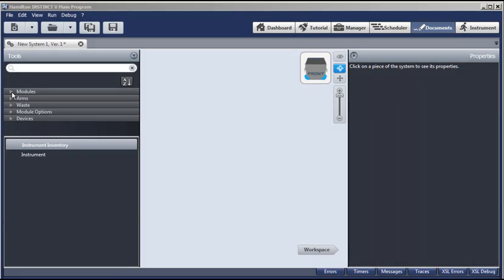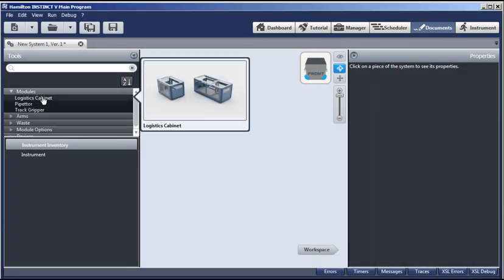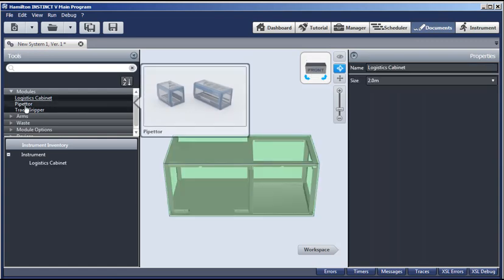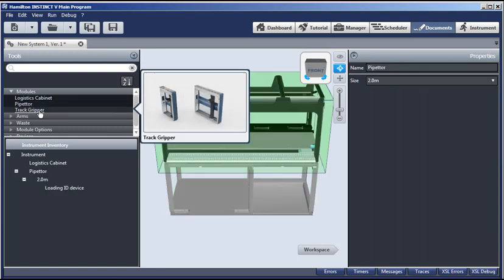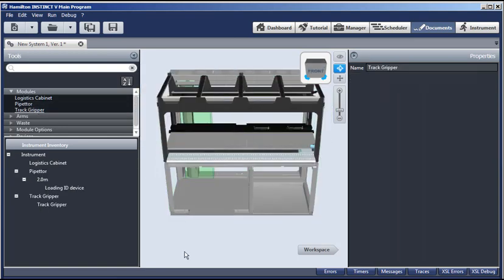The first thing we're going to do is select Modules. We'll place a 2-meter logistics cabinet. Simply double-click. And on top of that, we'll place our pipetter. So again, double-click. And all of these items appear in the instrument inventory.